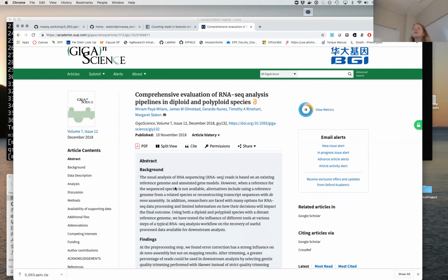If less than half of my data set is mapping back to my reference, then I would get really worried. Preferably, if you're sequencing a species and that exact species has a reference genome, you want to see 90% plus of your reads mapping. They may be multi-mapping, but they're mapping, which is good. But if it's less than 50%, or even less than like 75%, you really need to start asking yourself some hard questions about what's going on and why your reads aren't mapping, and if it's better to do a de novo assembly.